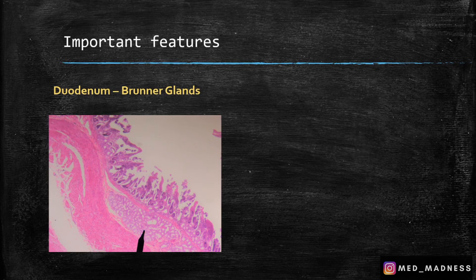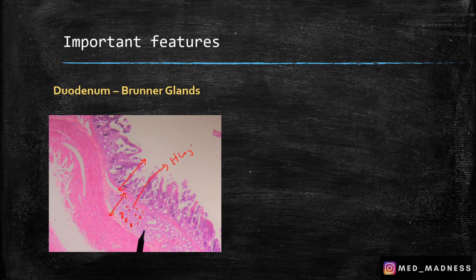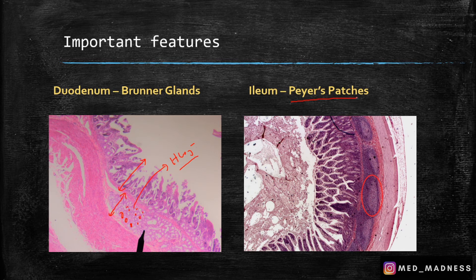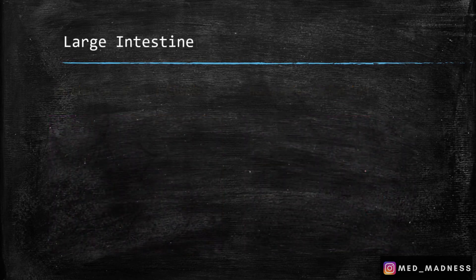Peyer's patches are lymphoid aggregates in the lamina propria and submucosa of the ileum, where B and T cells are large in number. Now I'll show you the histology slides. This is the duodenum — you can see the mucosa and the submucosa. If you look into the submucosa, you can see glands — this is the most distinct feature of the duodenum: Brunner's glands, which secrete bicarbonate into the lumen of the duodenum to help protect the duodenal wall from acids. For the ileum, you can see Peyer's patches in the submucosa as well as in the lamina propria.